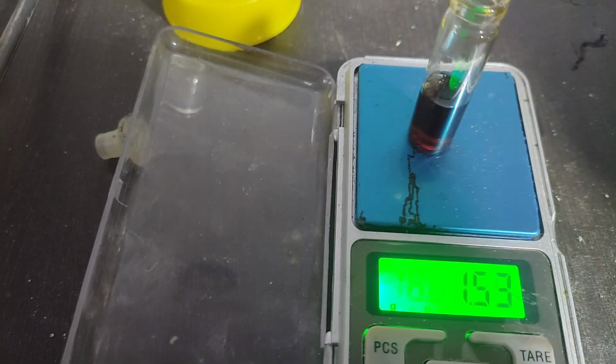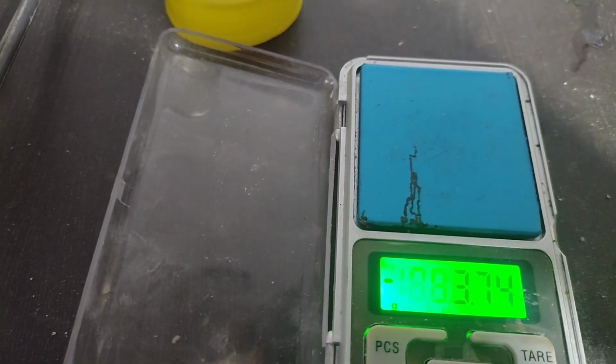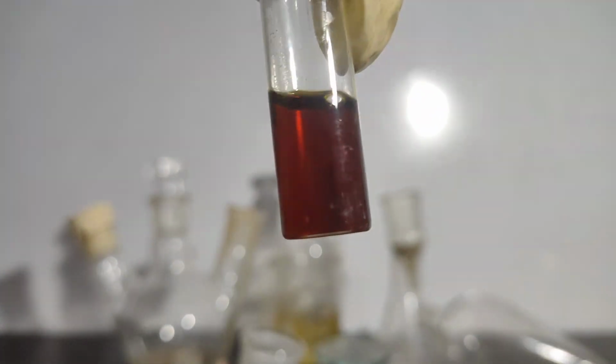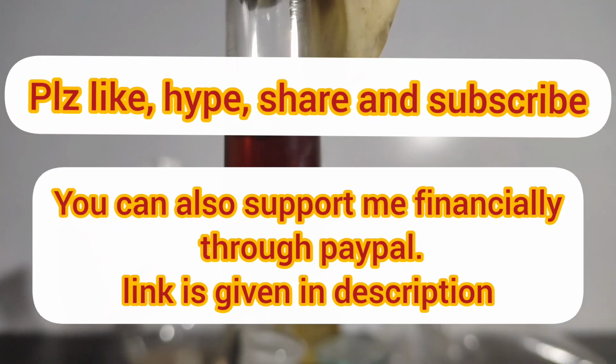I then measured the yield and it was 1.53 grams, which is even more than the theoretical, which is 1.1 gram, which means it still has petroleum ether left. I thought that my isocyanide had been destroyed, but it still had a strong odor of isocyanide, and when I tried it in reactions it worked.